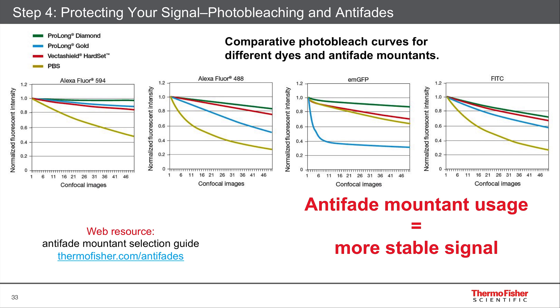For those who like data, here are some graphs that show photobleaching. These are normalized to their initial intensity, and you can see over time that the intensity decreases, as shown by the lines here. Yellow is just PBS, and for many samples that's the worst. But using an antifade mounting medium like our Prolong Diamond — shown in green — you can see that you're able to retain the signal much better over time. We have a selection guide online that you can use to help choose an antifade mountant; you can see the URL here. Remember, using an antifade mountant means you have a more stable, longer-lasting signal to give you the best signal to background.